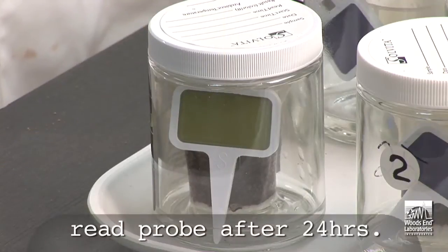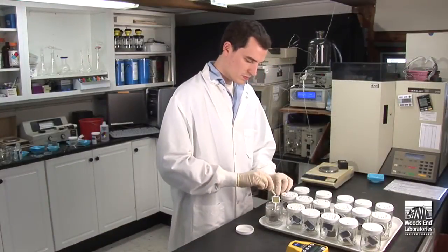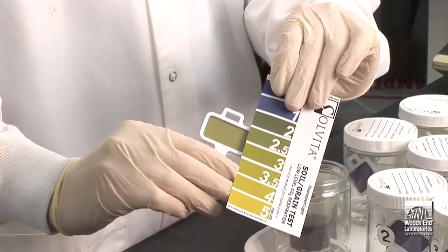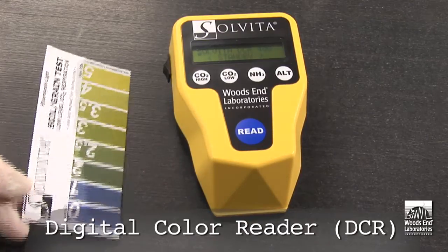The test is complete after 24 hours. Now we observe that the probe has changed in color in proportion to the absorption of evolved carbon dioxide. You can estimate the result by comparing to the color chart provided, which shows the results in five color changes. To realize the full potential of the procedure, however, the digital color reader is employed to quantify the color change.